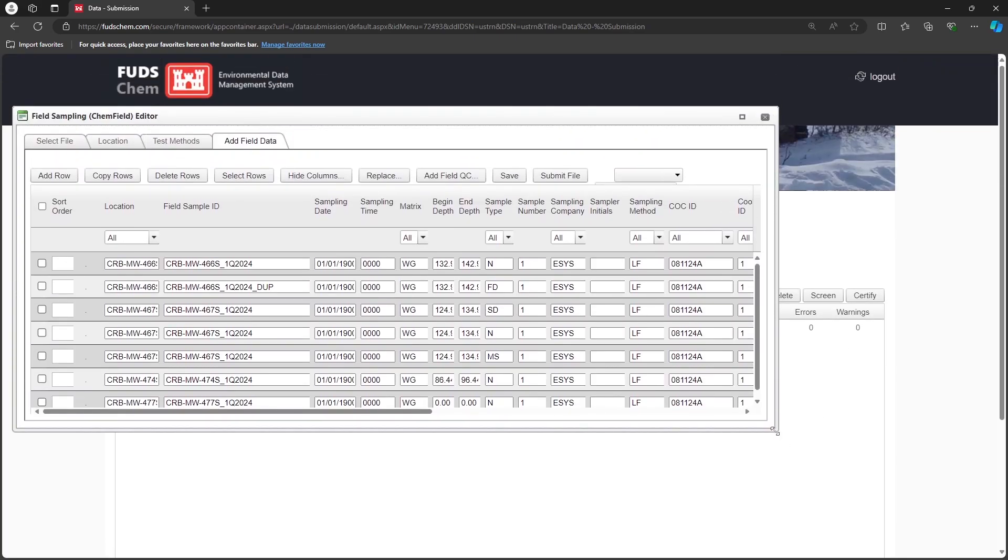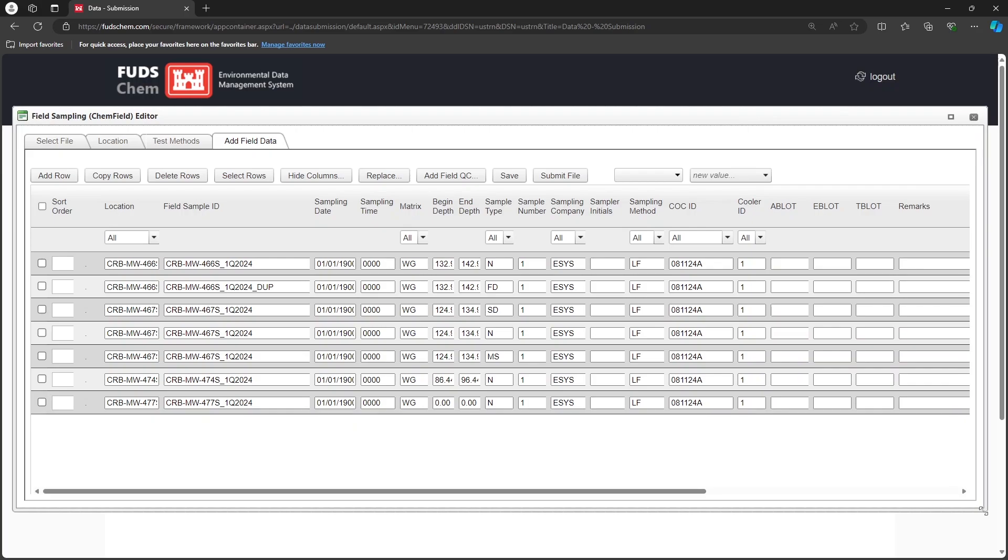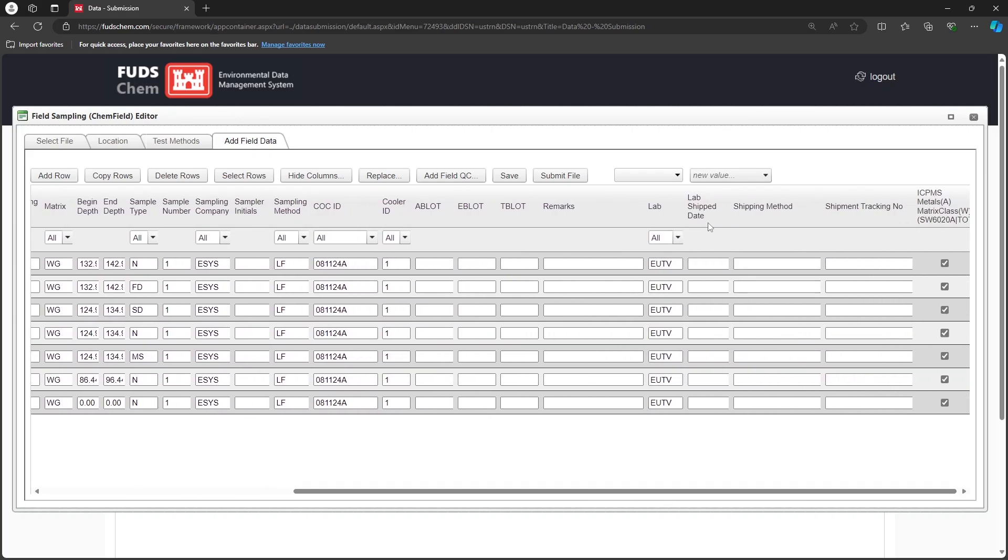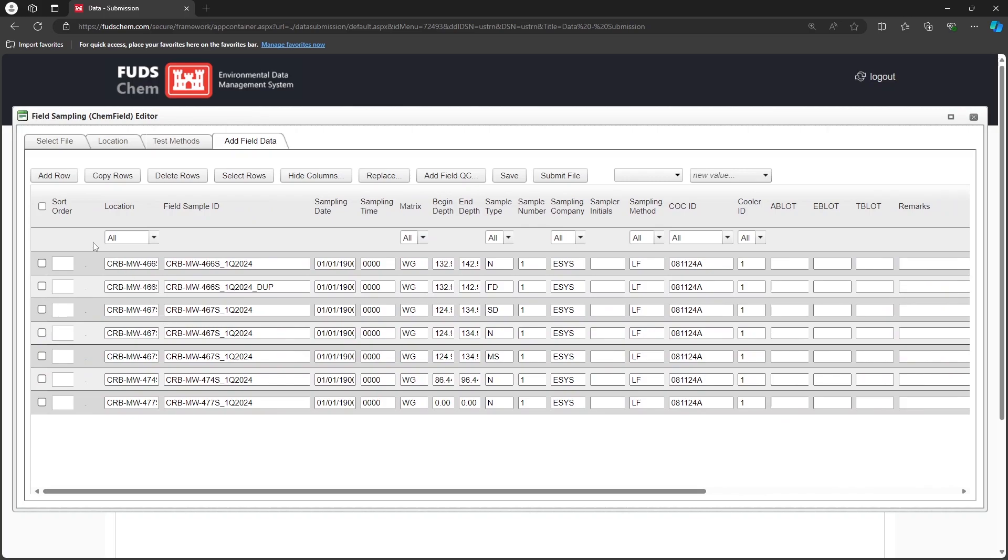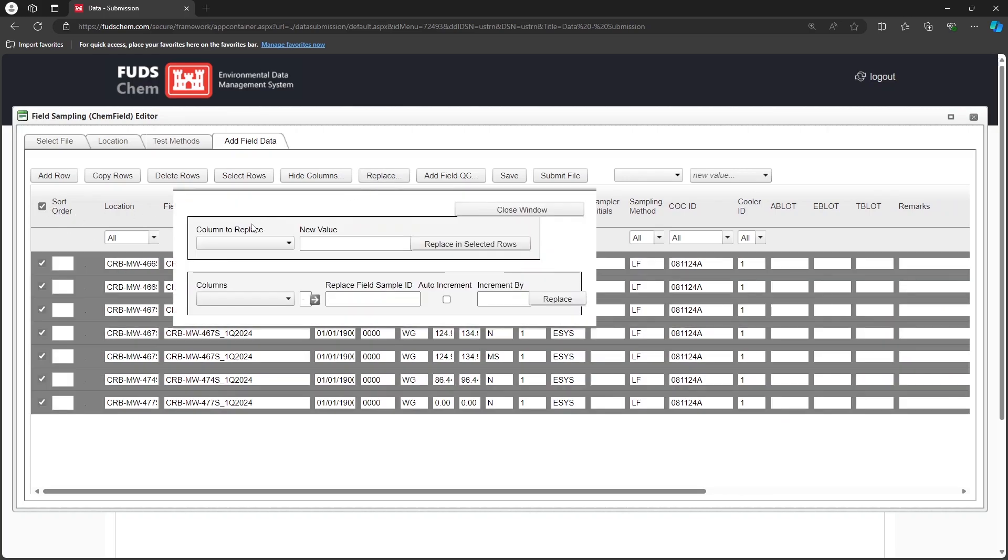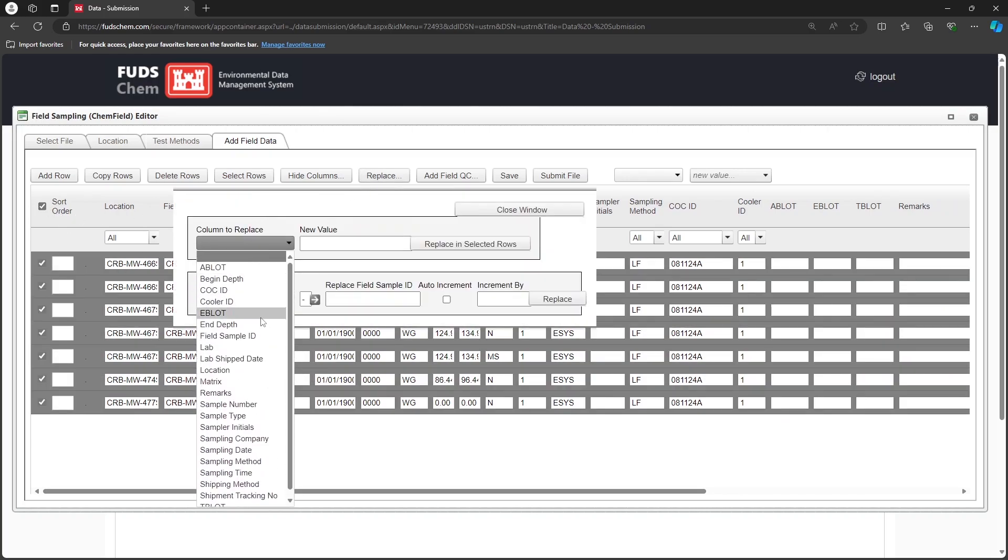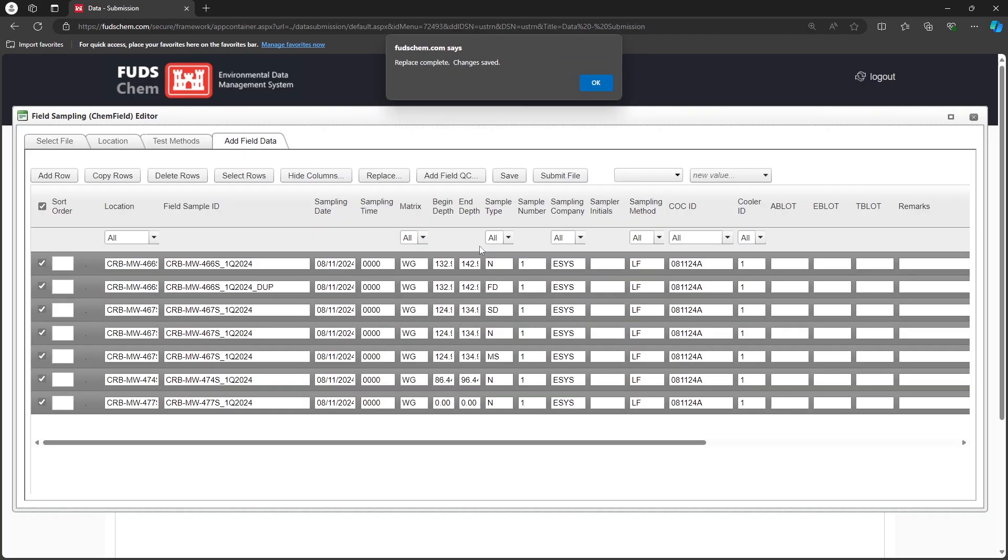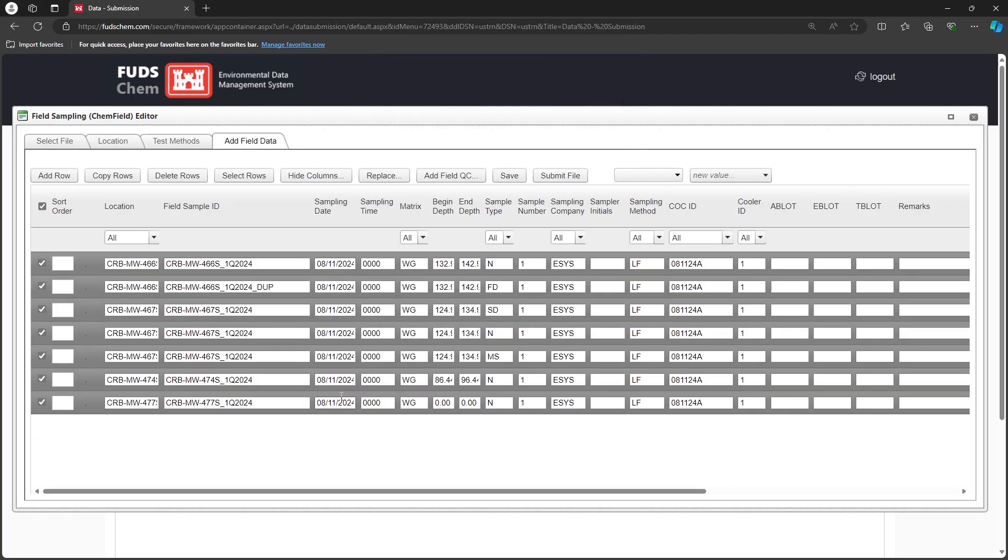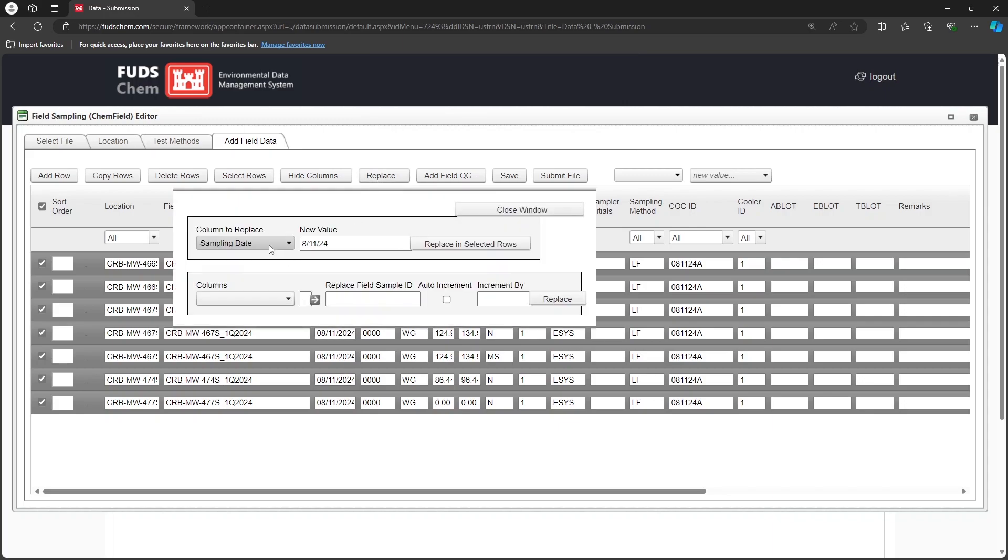Our field team has provided sampling dates and times, sampler initials, and a lab shipped date. Let's say that all of our samples were collected on the same day. We'll click the Replace button, choose Sampling Date, and enter the date that the samples were collected, in this case August 11, 2024. Click Replace in selected rows. Using the same process, we will replace the sampler initials with VM, and the lab shipped date with August 12, 2024.